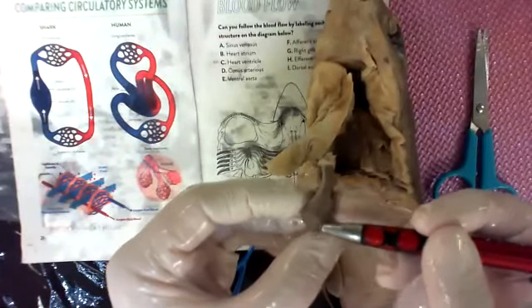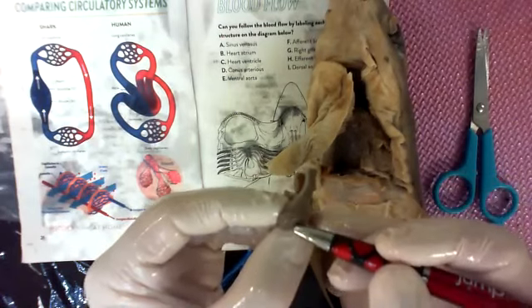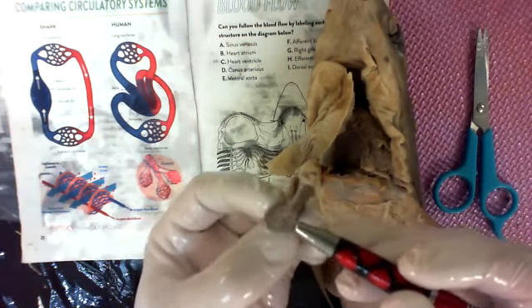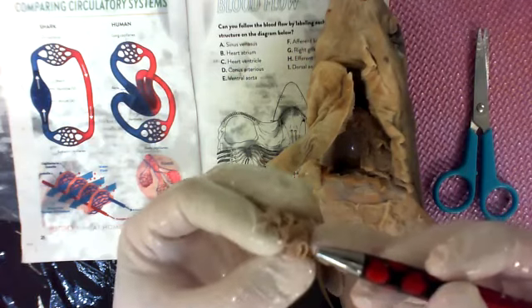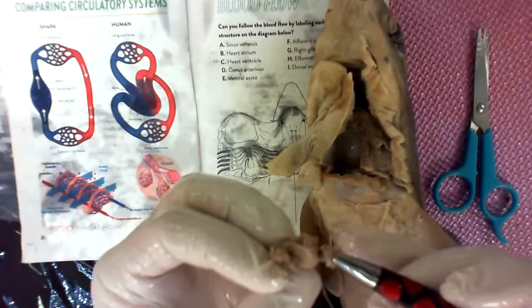All right, so the blood's down in the ventricle, squeezes like this, and it squirts the blood into this conus arteriosus, pushes into the aorta, which was the ventral aorta, pushes up, and you can see here's a split here going that way, and then a couple smaller splits going over this way.